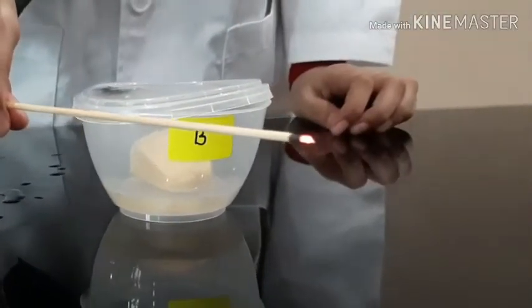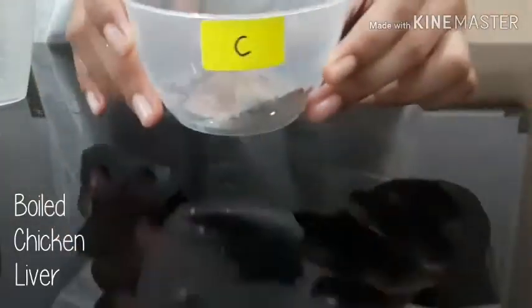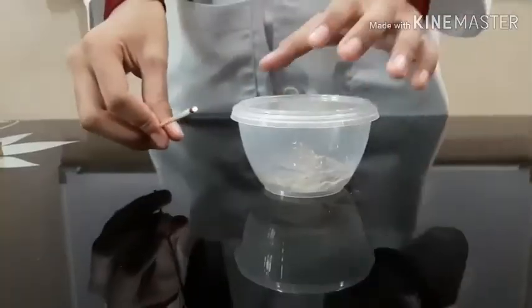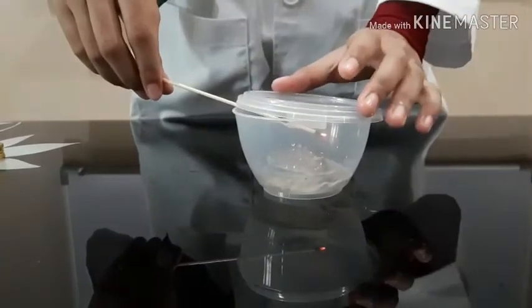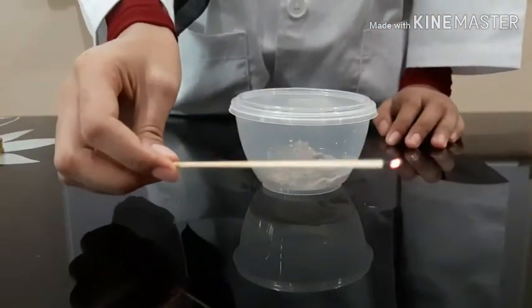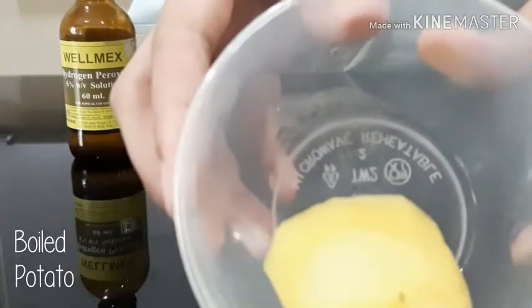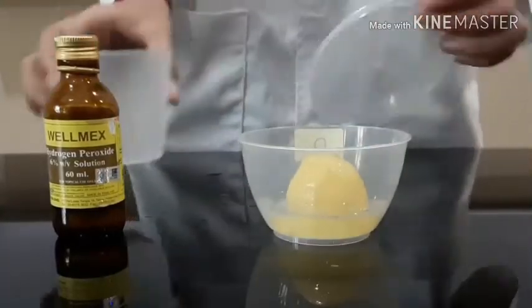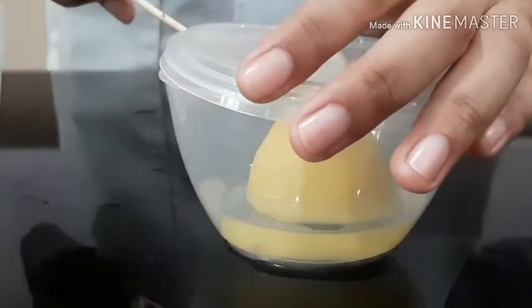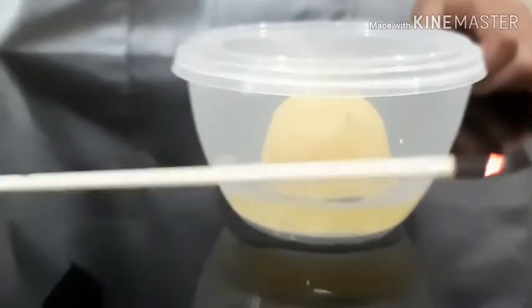The wooden splinter is not burning because there is not enough oxygen. The wooden splinter is not burning because this process does not produce oxygen.